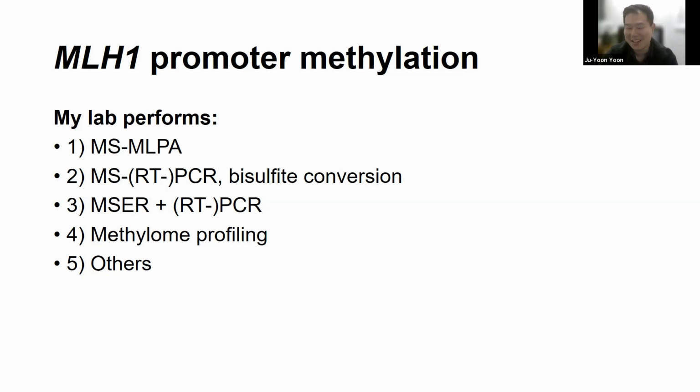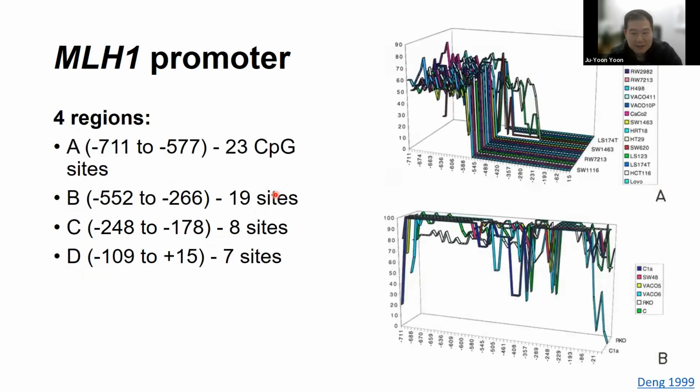Okay, so it looks like everyone who answered performs MLPA, which is very interesting. I thought at least some labs would be performing MS-PCR with bisulfite conversion, but it looks like MLPA is a very popular assay. It's certainly very robust. My lab's actually validating an assay using restriction digest, and we'll talk a little bit about that later.